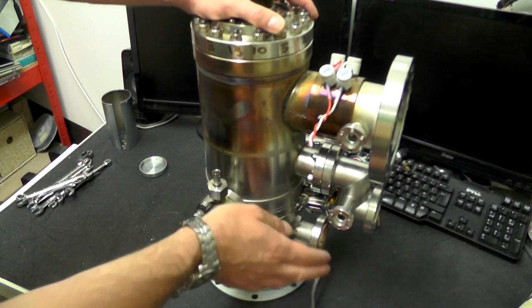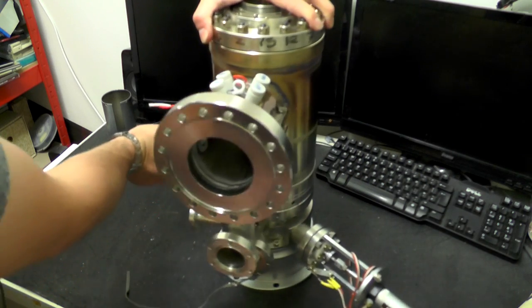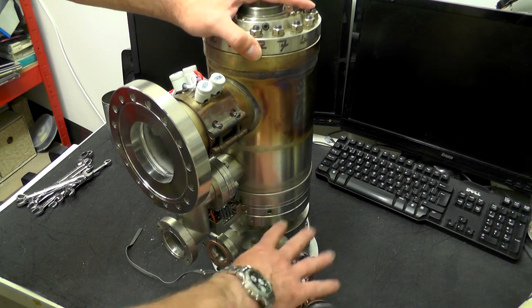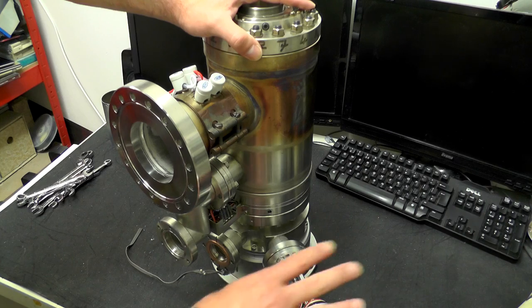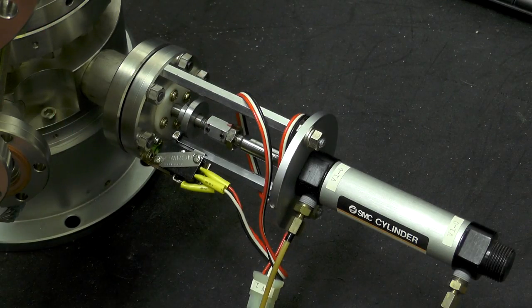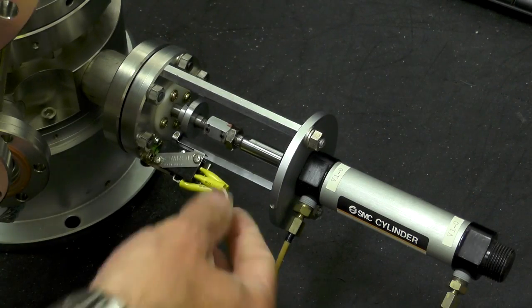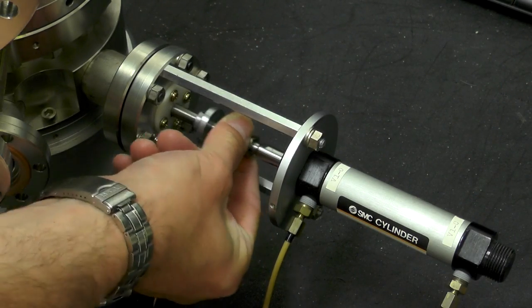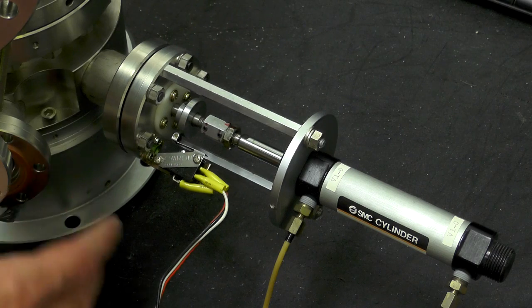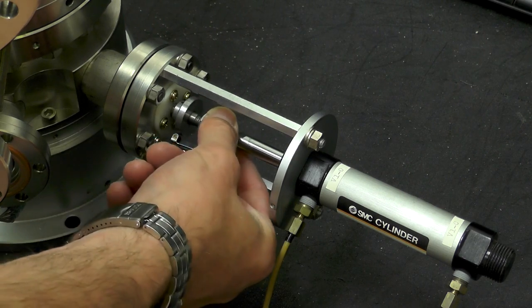Down in the base here we have another section, and I believe this is basically a valve to completely close off the column from the sample chamber. That seems to be achieved by this pneumatic piston which inserts something into the chamber. Can't quite see it from the outside so hopefully we'll be able to see more when we take it apart. There's a small micro switch there which obviously just detects when it's actually in place.